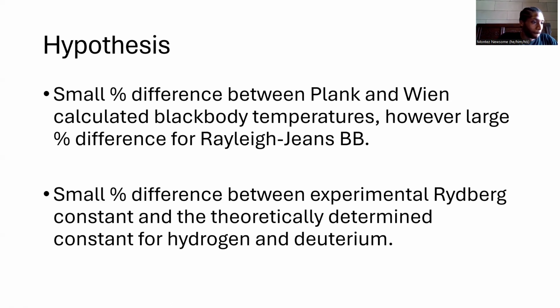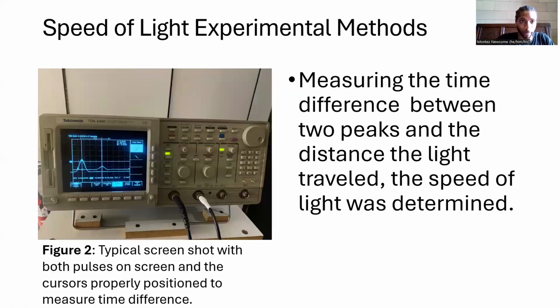And then support for the second hypothesis is that the three peaks found for H1 and H2 will have less than a 5% ratio. So these two hypotheses will be discussed later in the results to see if they were upheld with experimentation or failed with experimentation.